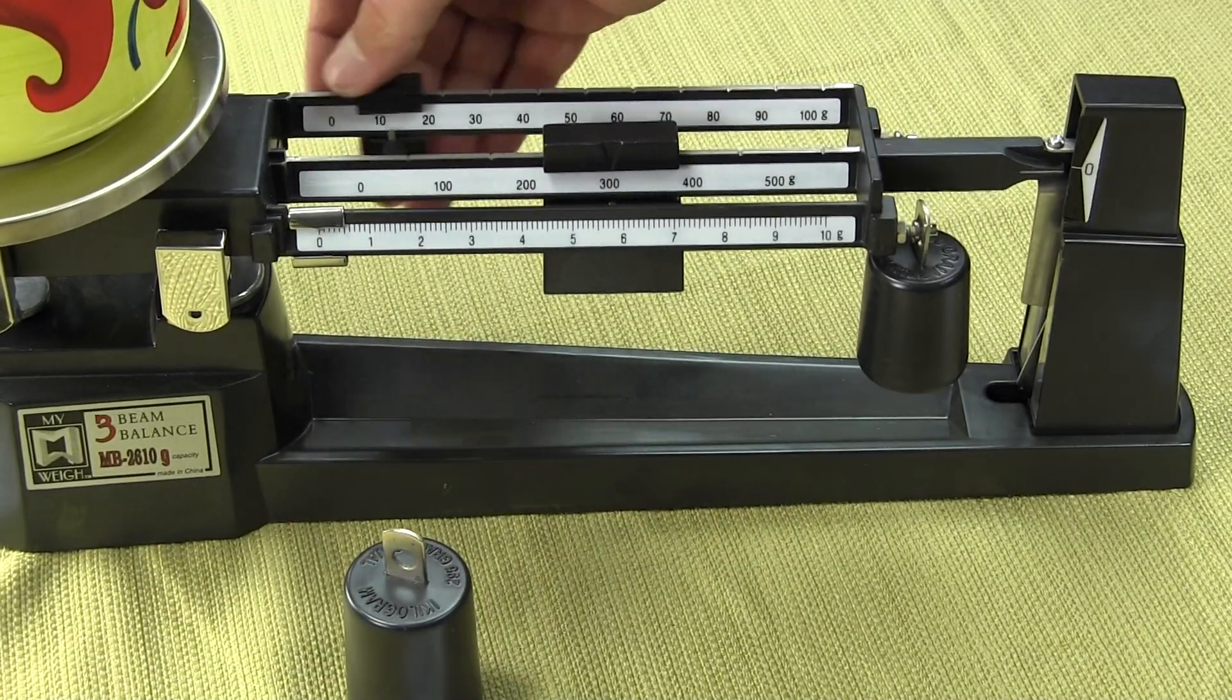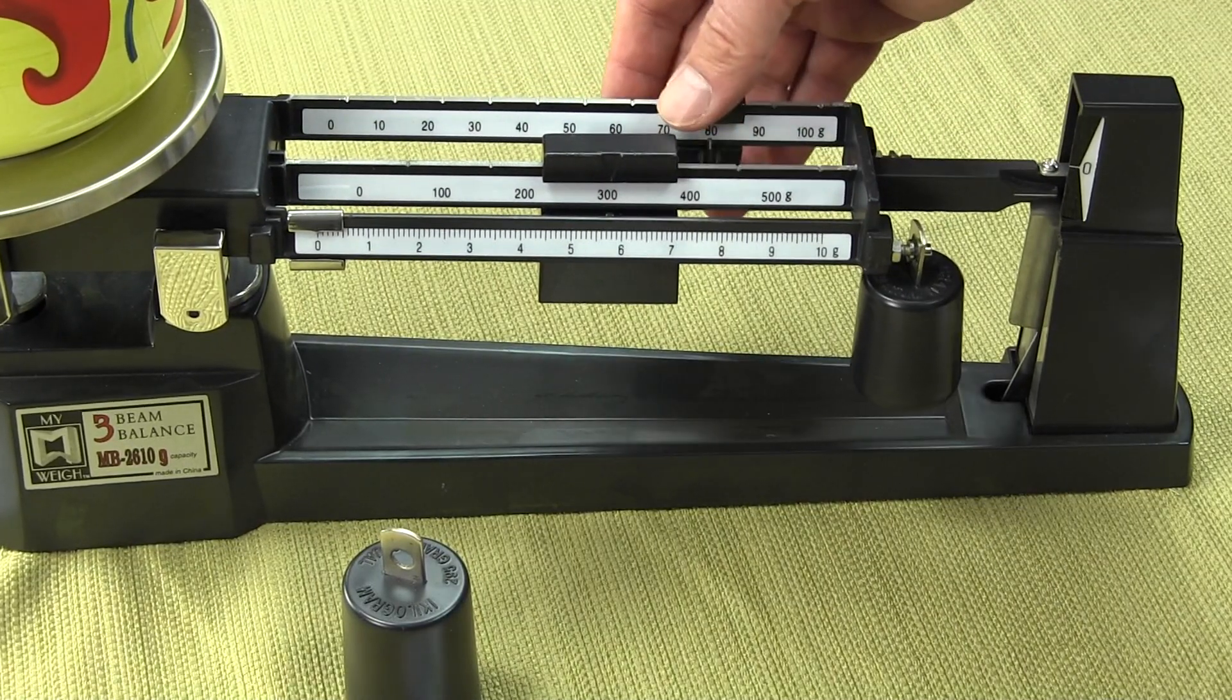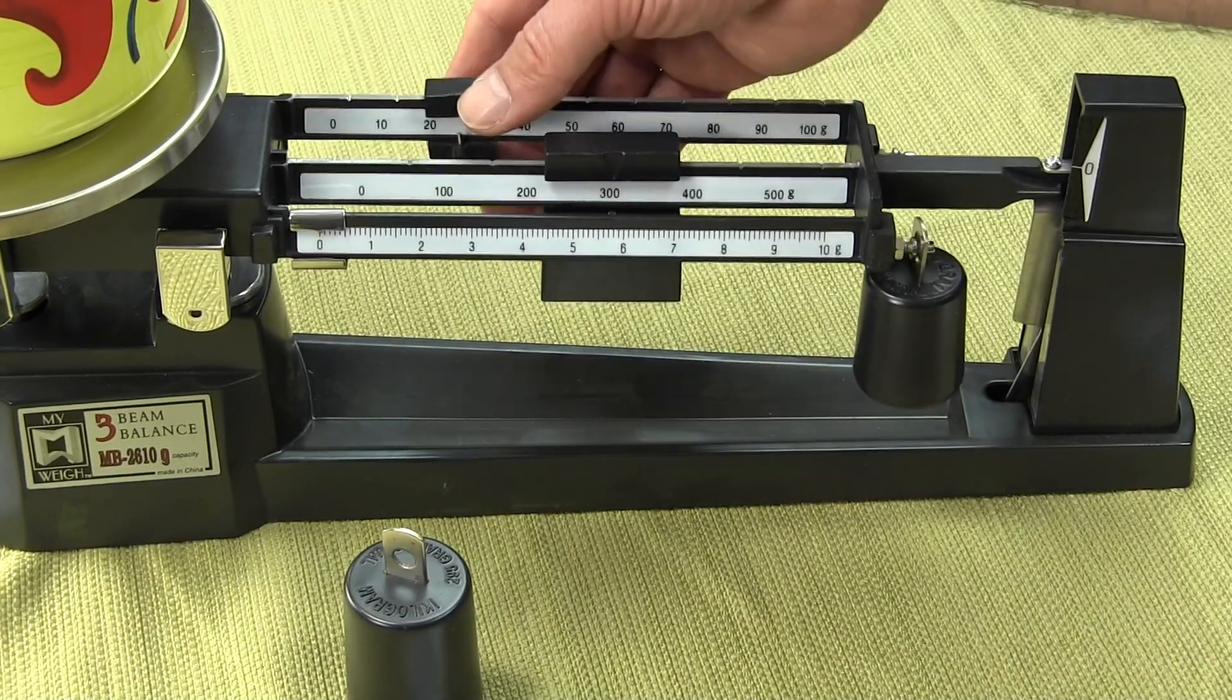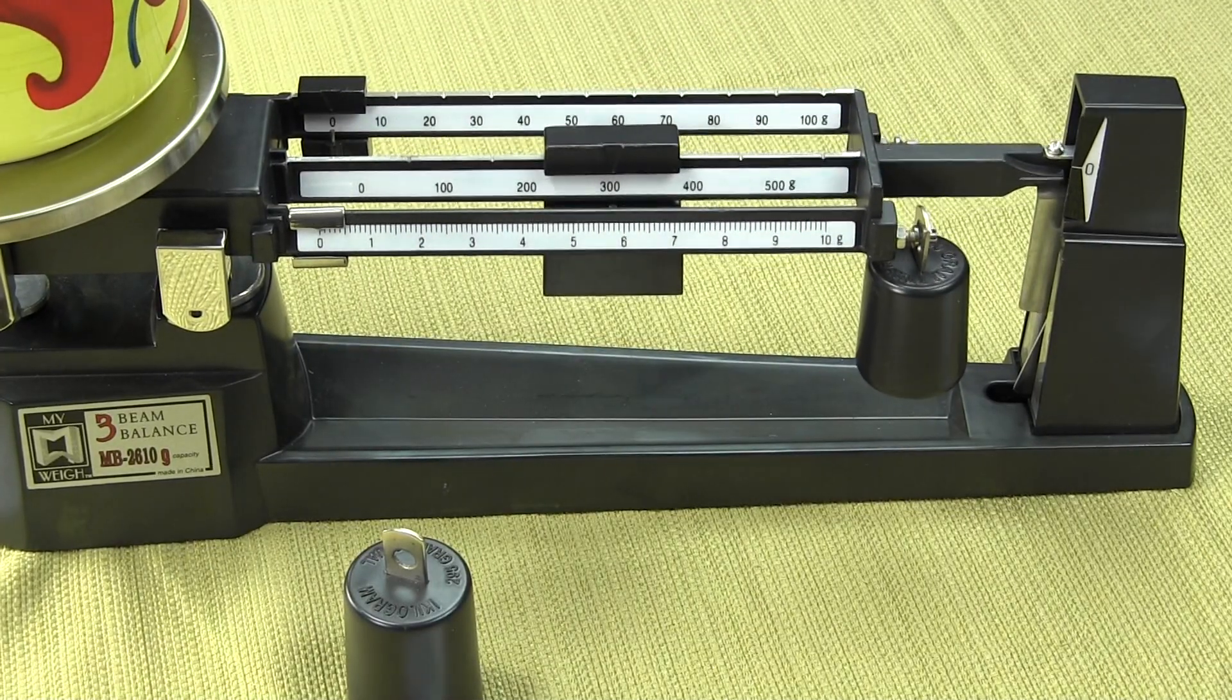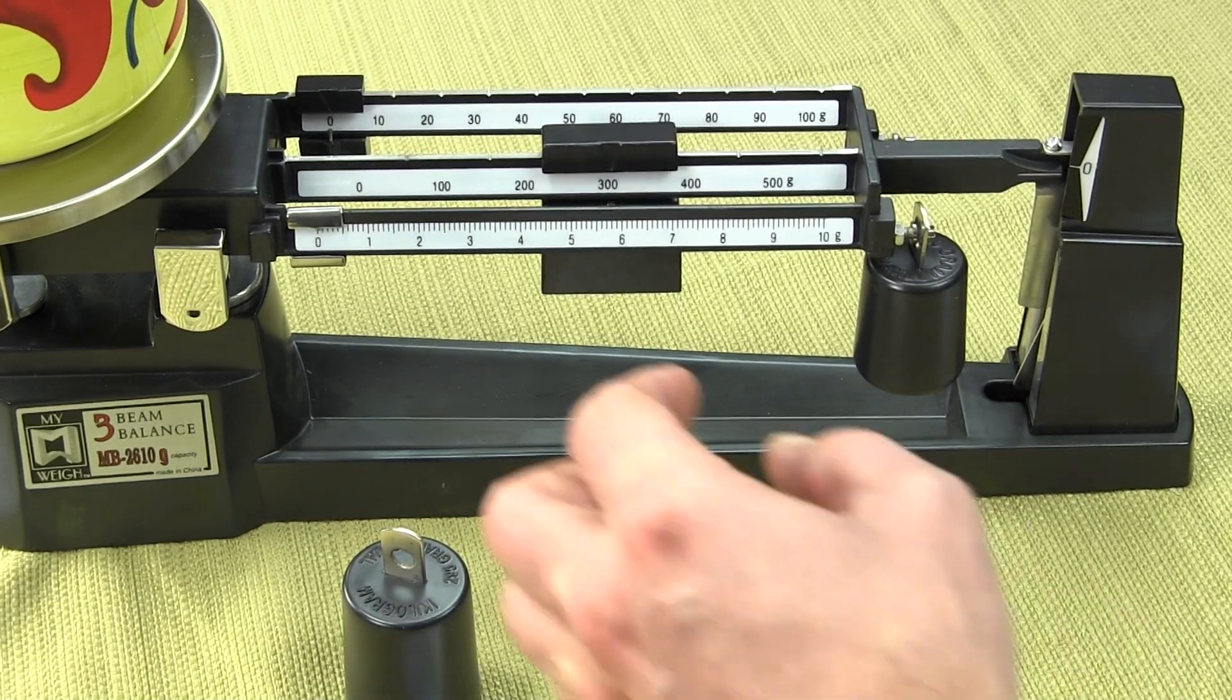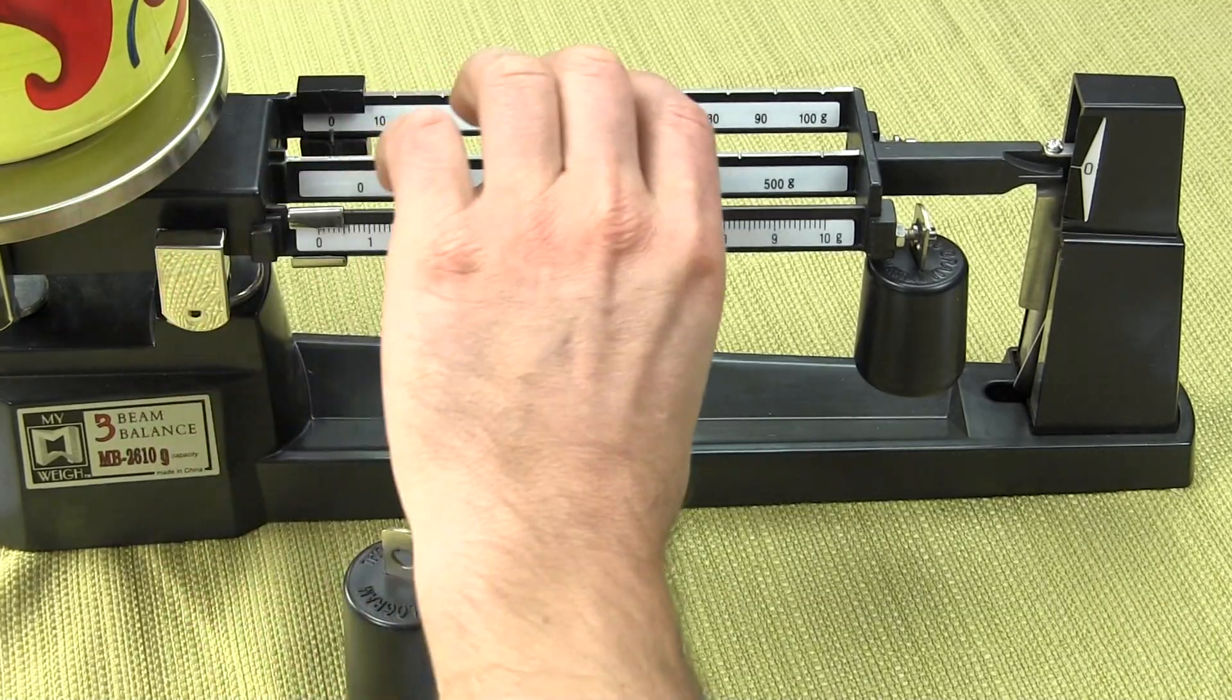Now we're going to use the 0 to 100 and it's the same deal. Just stop pulling it back until the beam goes up. Now we'll just use the front.